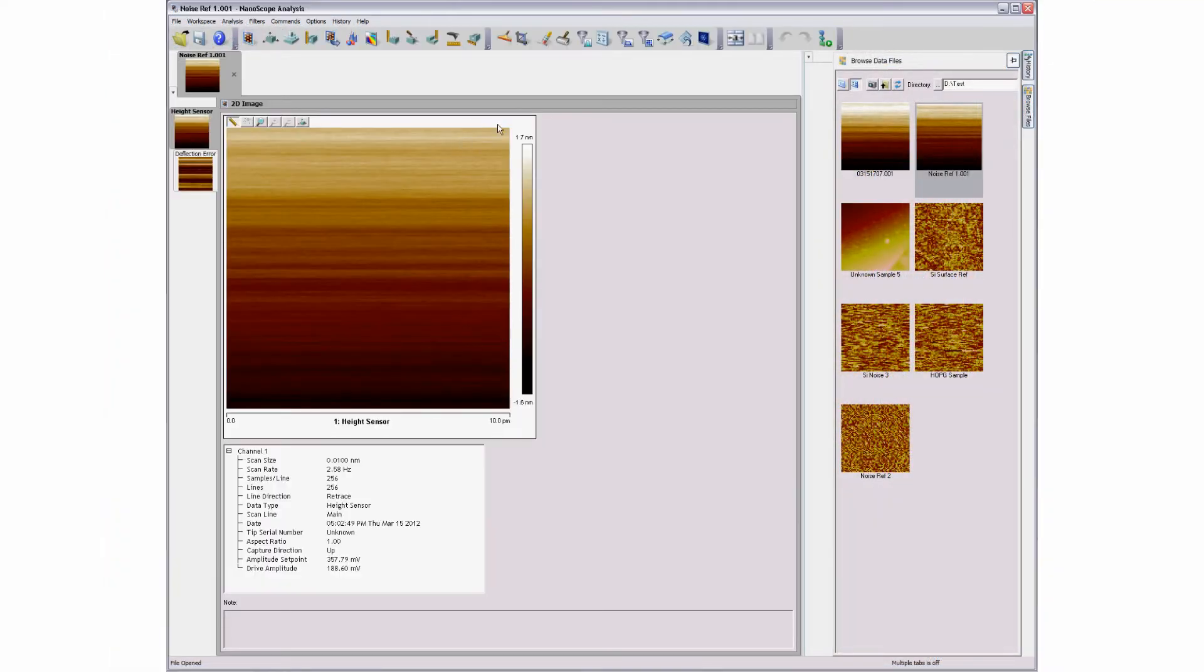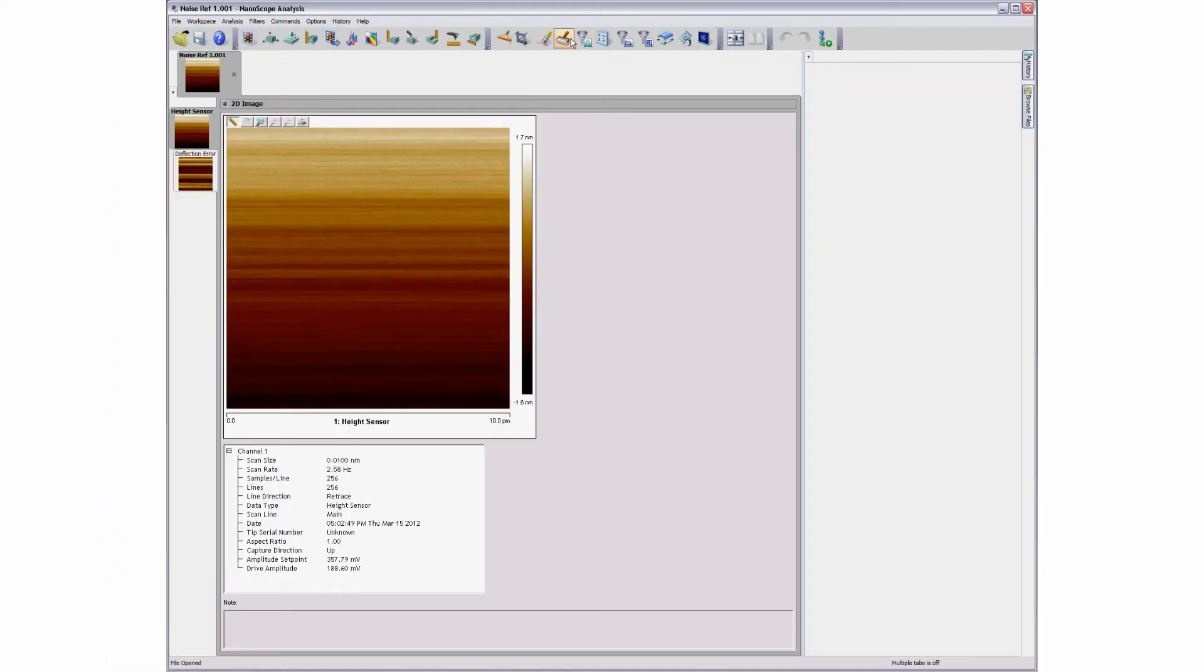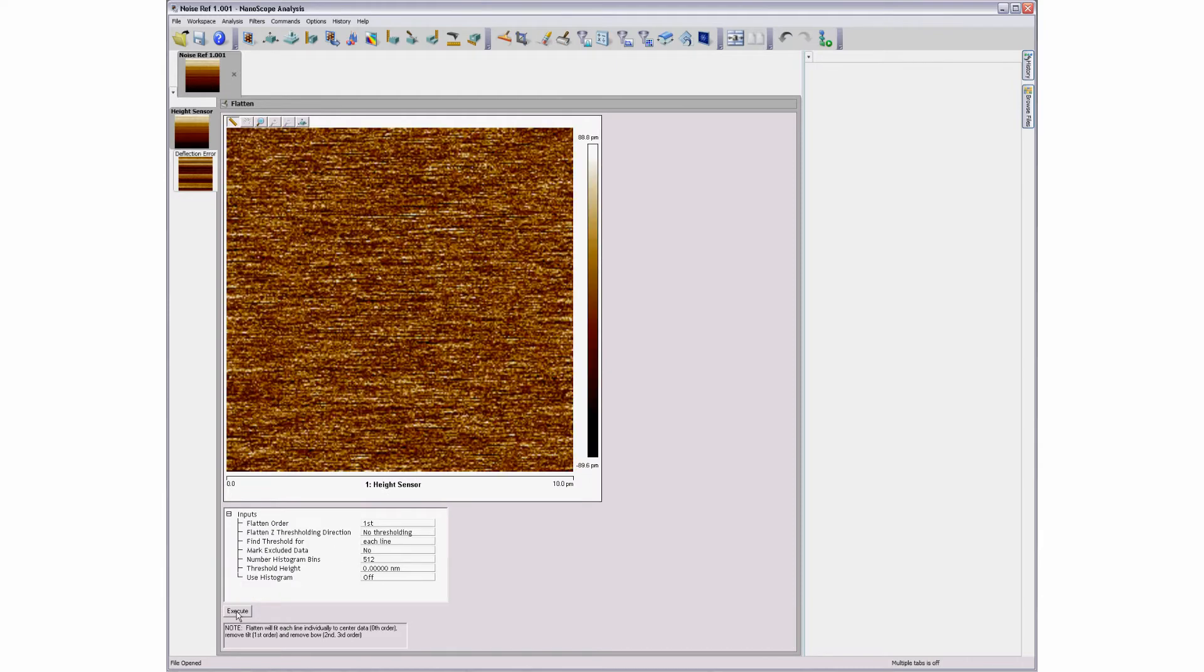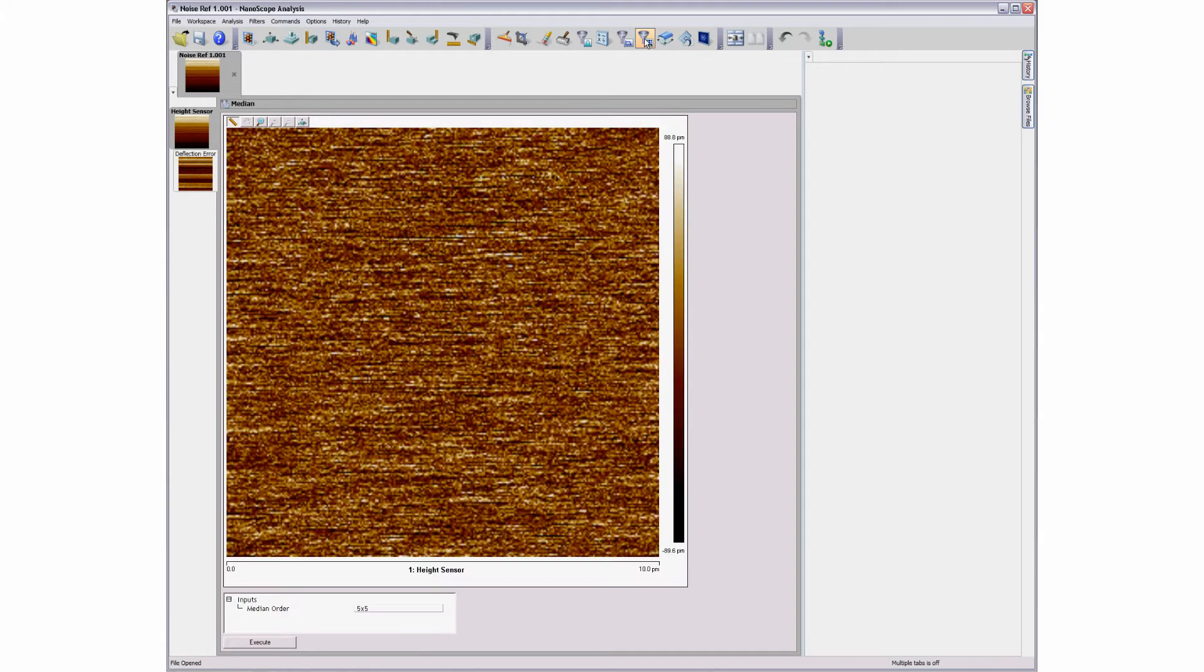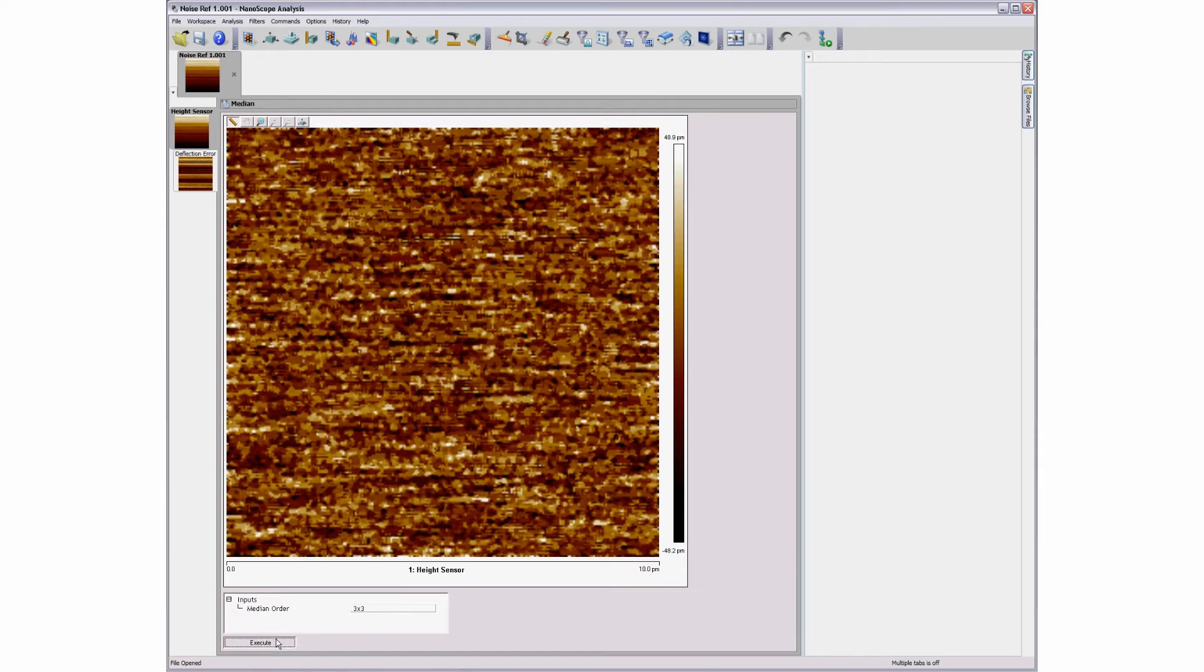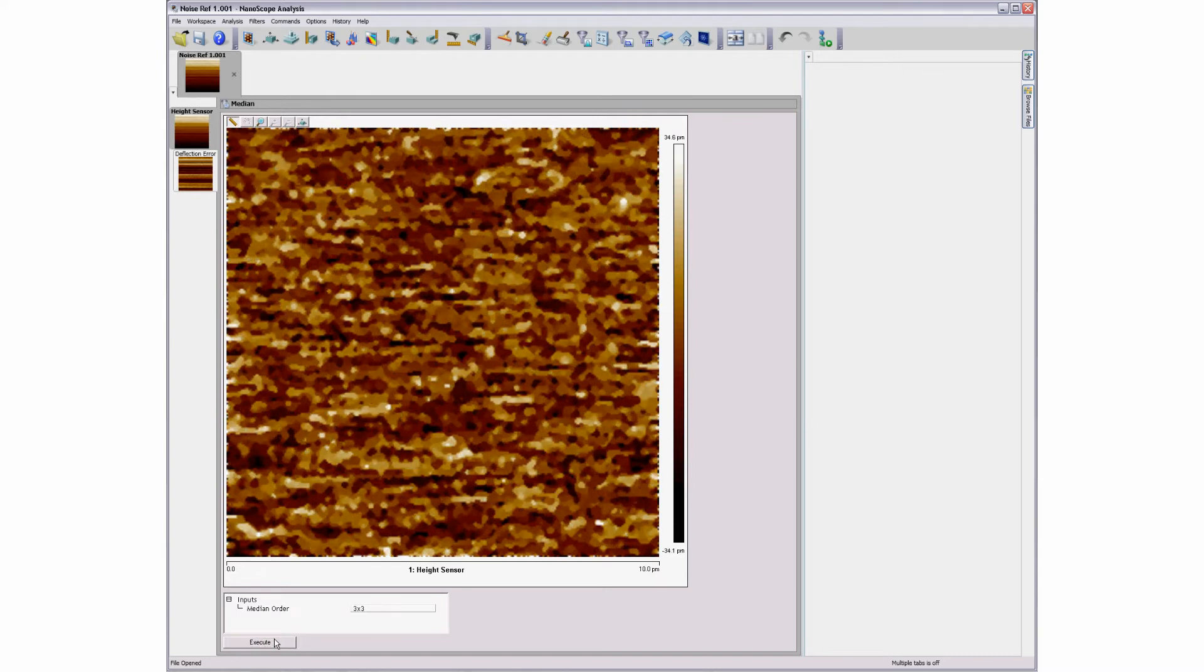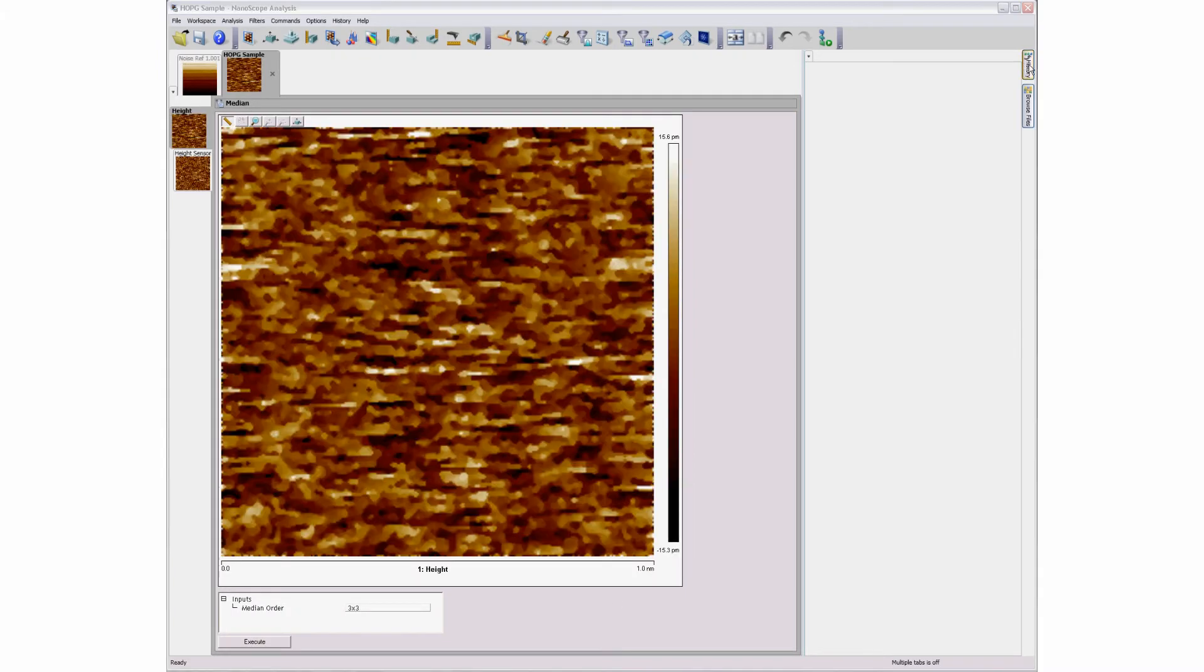Sometimes it may be necessary to process numerous image files using a set of sequential operations with multiple steps or repetitive commands. The user can perform a sequence of processing steps on a typical file and the steps will be recorded in the history cache.